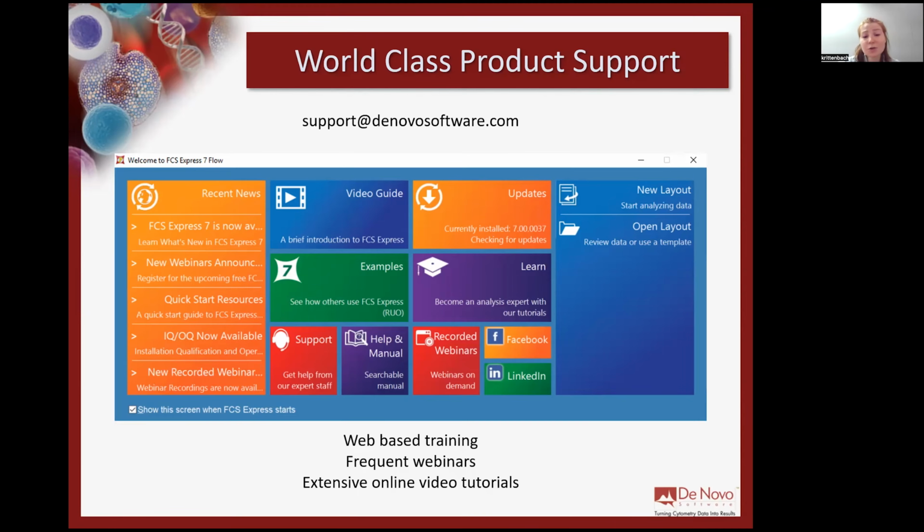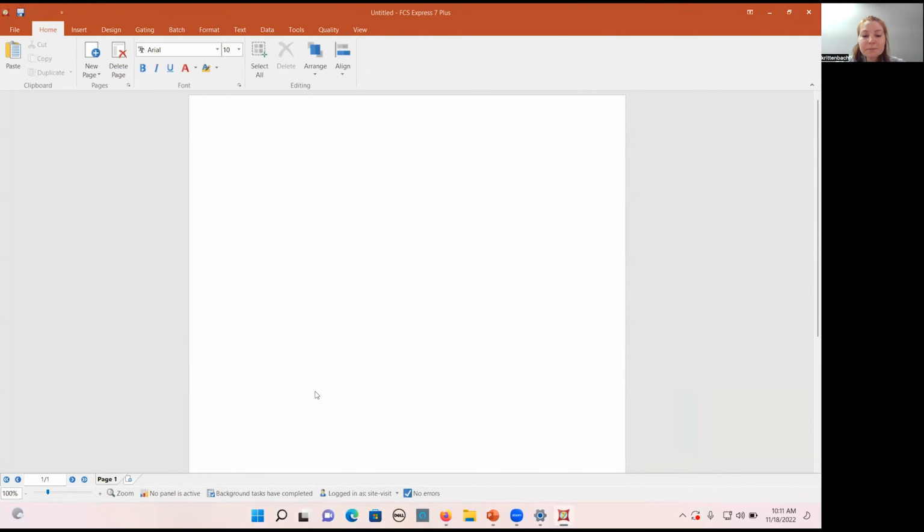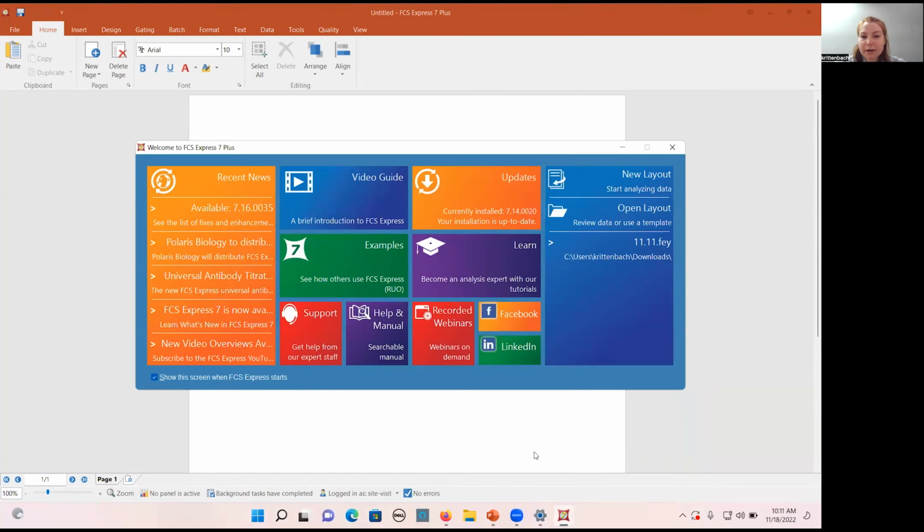If you forget how to use a tool or a feature, I'm going to go over all of these resources in just a minute. So let's jump into the software. When you launch the software, the first thing you're going to see is this startup screen, and this is where all these resources are available for you.